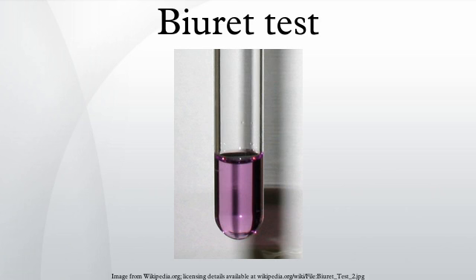The Biuret reaction can be used to assess the concentration of proteins because peptide bonds occur with the same frequency per amino acid in the peptide. The intensity of the color, and hence the absorption at 540 nm, is directly proportional to the protein concentration, according to the Beer-Lambert law. Despite its name, the reagent does not in fact contain Biuret, H2N-CO-NH-CO-NH2. The test is so named because it also gives a positive reaction to the peptide-like bonds in the Biuret molecule.